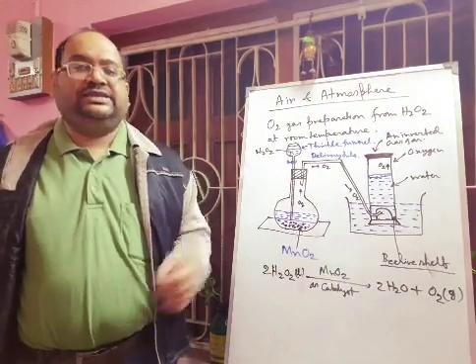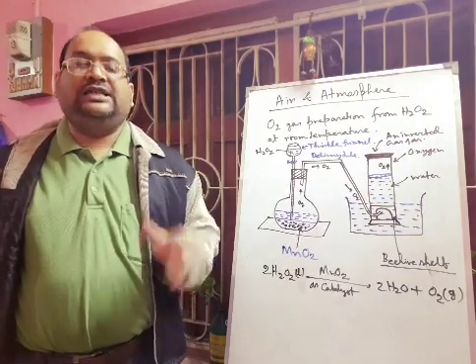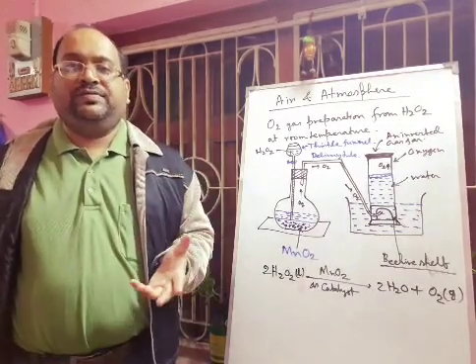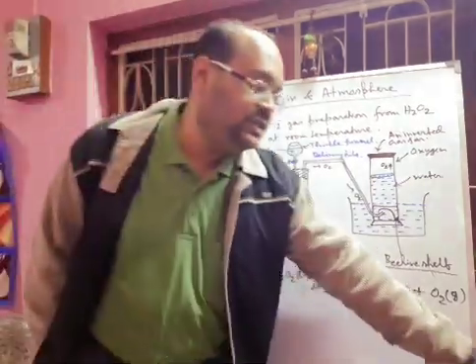Next one, an activity is there. You have to fill a gas jar with oxygen, and then if you enter a glowing splinter, the glowing splinter will rekindle. What will be your observation, that we will watch. Here I am showing this activity.